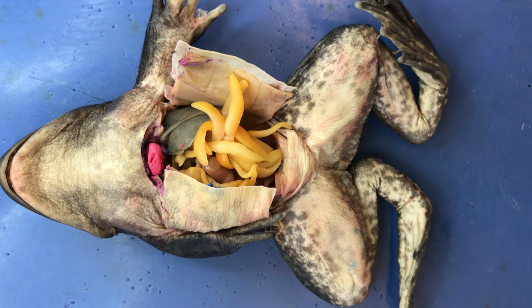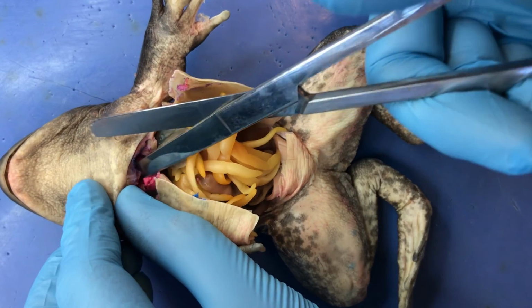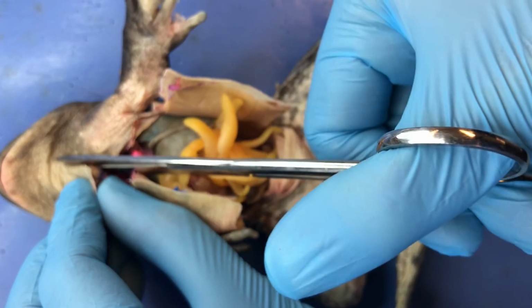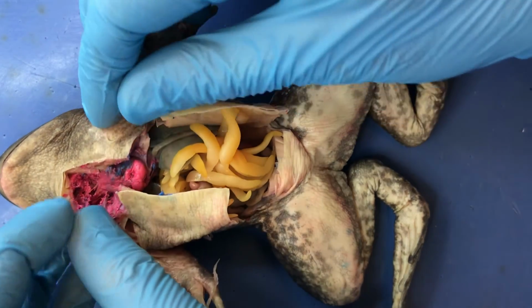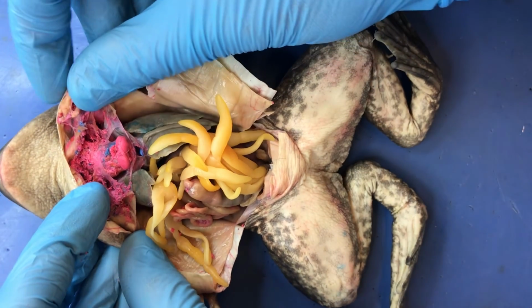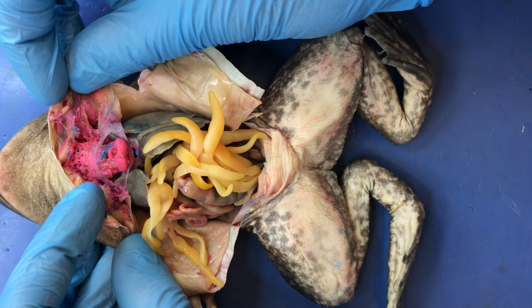Because the heart of the frog is located very far anteriorly, we need to extend the cut into the neck region to fully expose the heart. We are carefully cutting the skin of the animal. With the heart fully exposed, we now need to remove the prominent pericardial membrane that surrounds the heart.